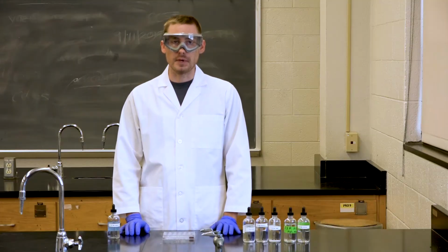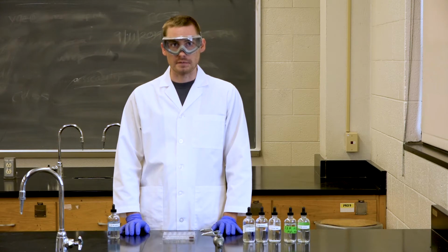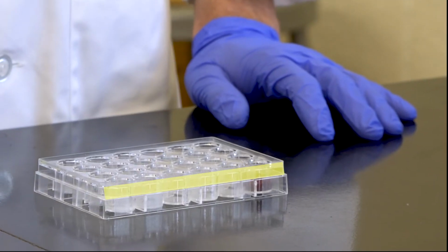So now that we've made a mixture of silver nitrate and potassium chromate, we're going to fill up the remaining 5 wells on the top row with silver nitrate.